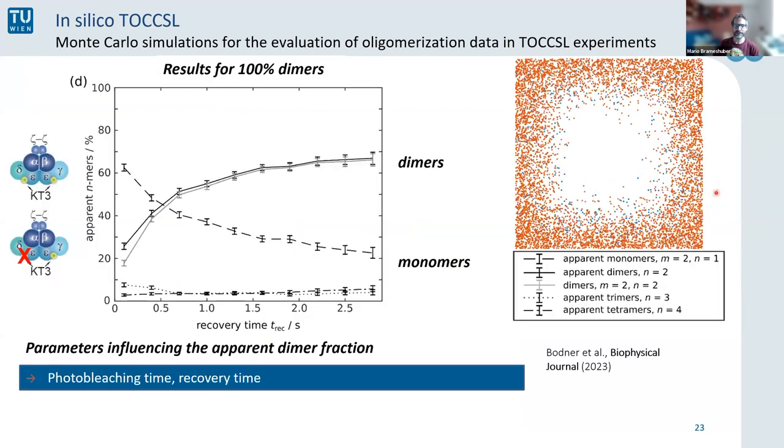So what we basically did is a lot of these Monte Carlo simulations, and to not make it too boring, I'll just show you the most important outcome of these. So we fixed the bleaching time.